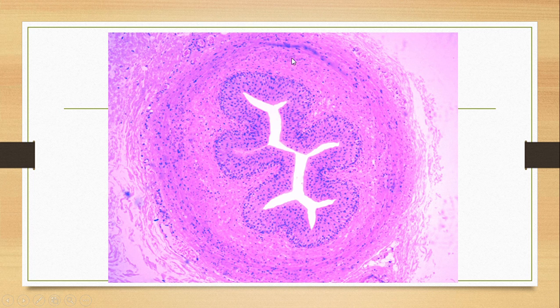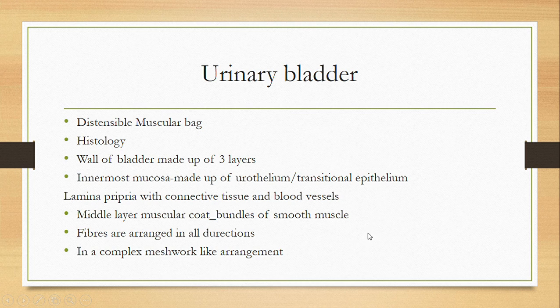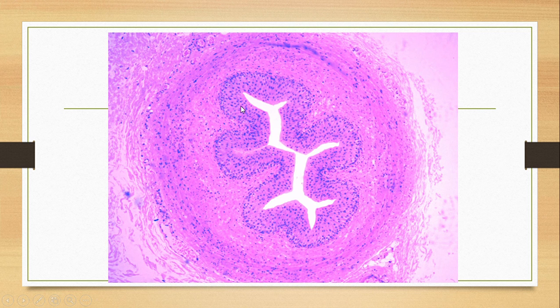The wall of the ureter is also lined with smooth muscle, and the ureter has an inner mucosal lining. Mucosa means the structures which are formed with the lining epithelium.